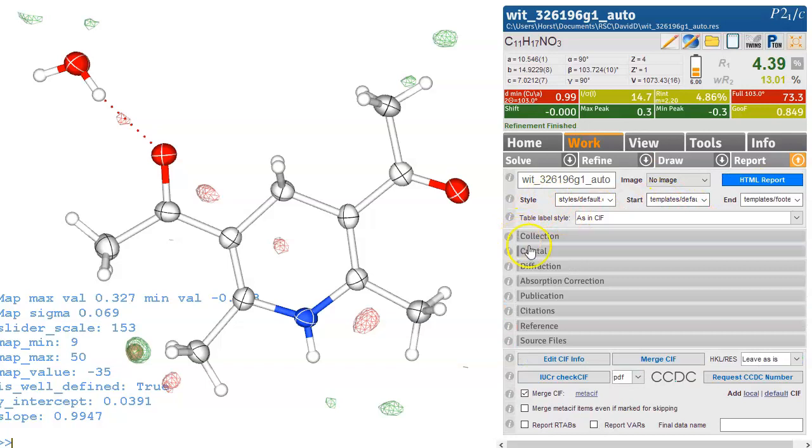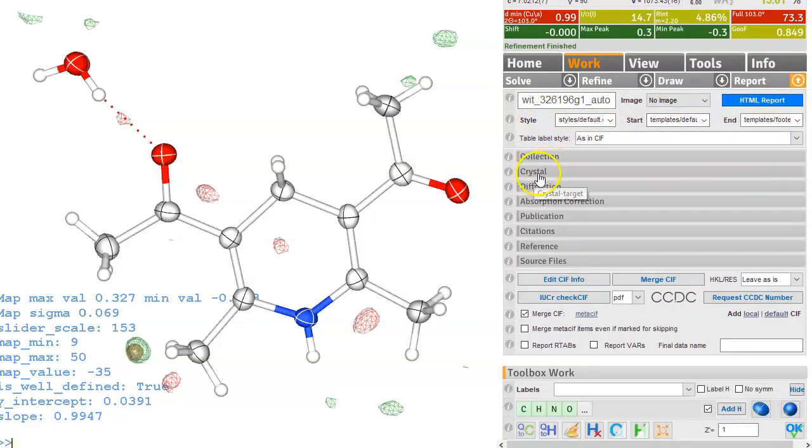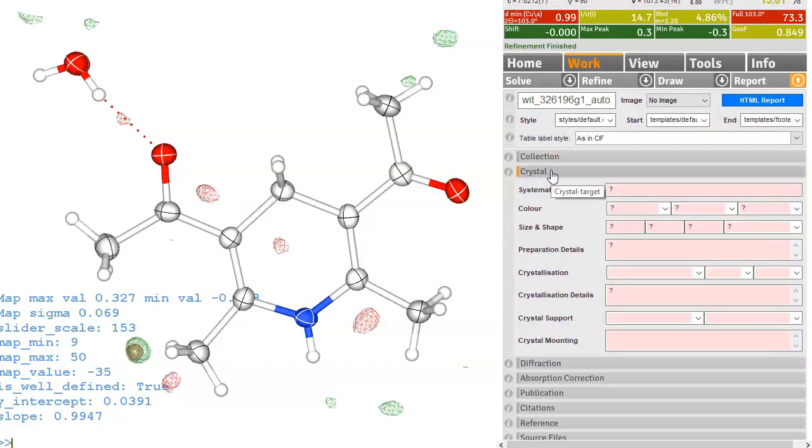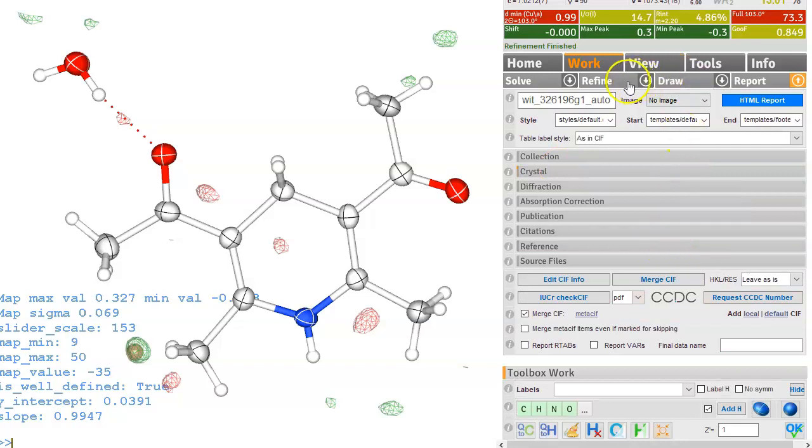We can head over to the report section so this is now going to be fairly empty because we don't have any information we didn't have a movie file we didn't have color and size and shape of the crystal so normally this would all come out of files that are in that base directory that you start with so a lot of this would be prefilled but in Olex2 you can then add information that is required.